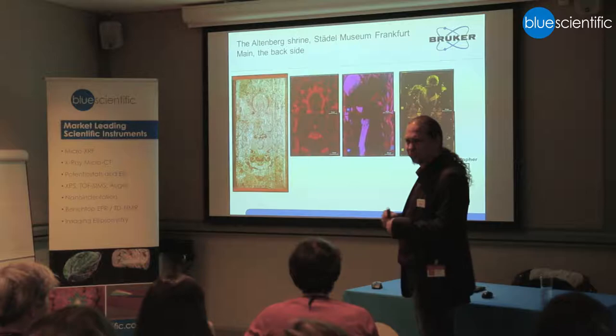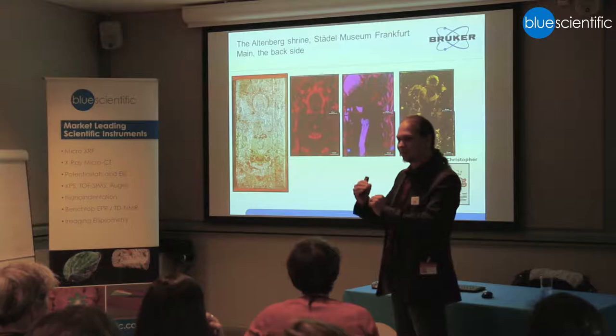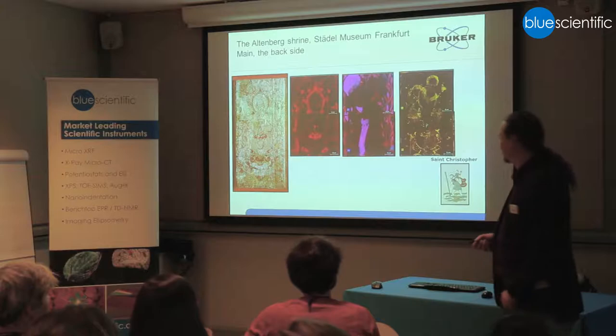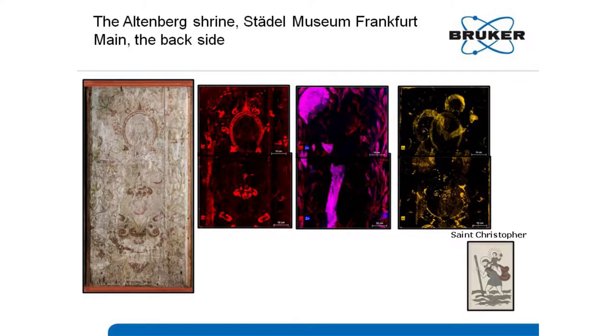The problem is that some colors — some pigments — were used in both layers, so you need to play a little bit with the thresholds to really identify what you want. Luckily, they were using arsenic, and after seeing the arsenic distribution, it became clearer — though I needed a little bit of help at the beginning — and that's what we see here.